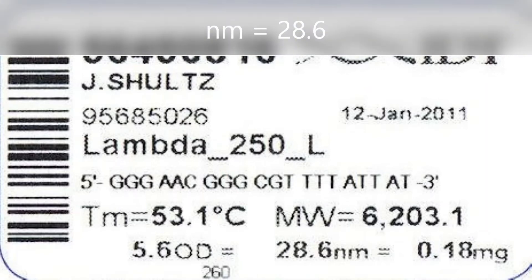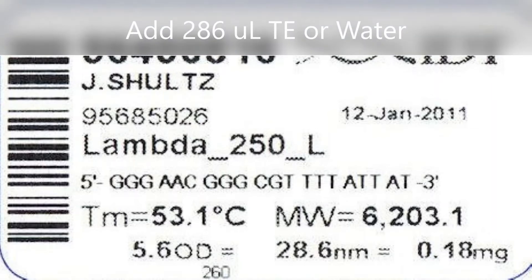To rehydrate these primers, simply add 10 times the NM value provided by the manufacturer. This will yield a 100 micromolar stock solution.